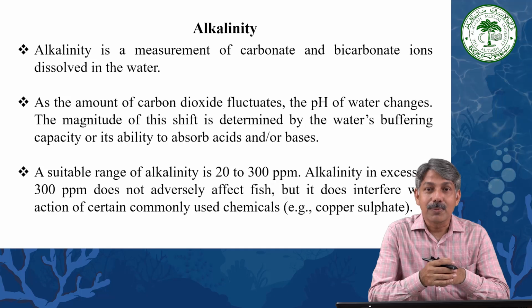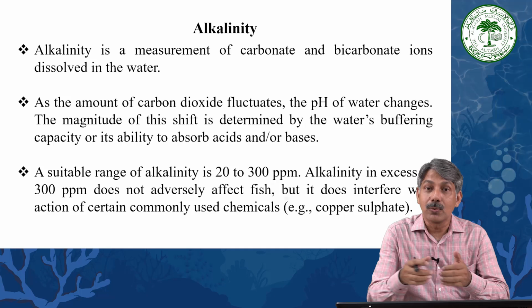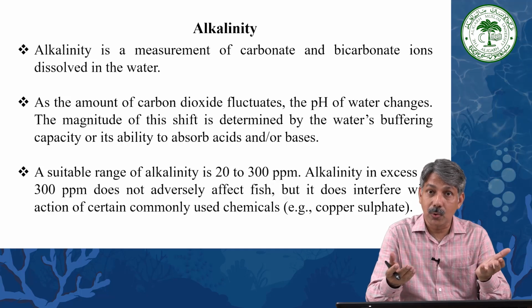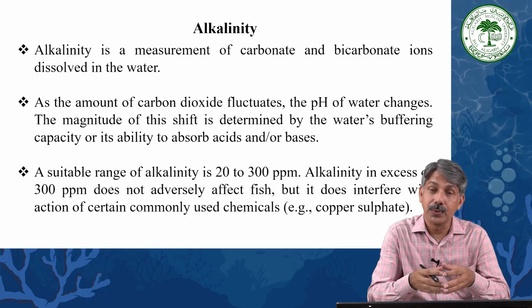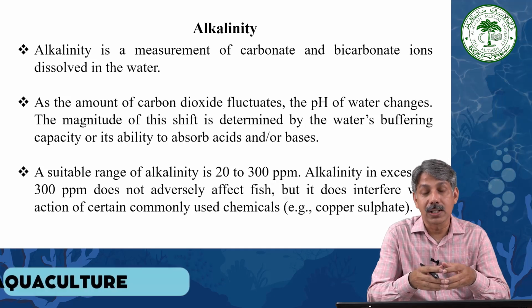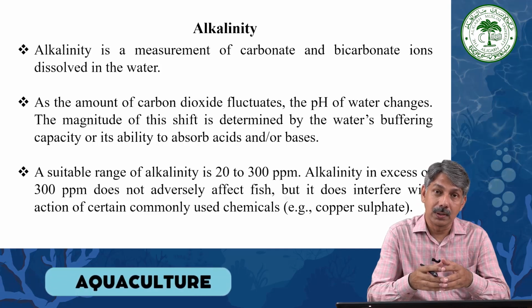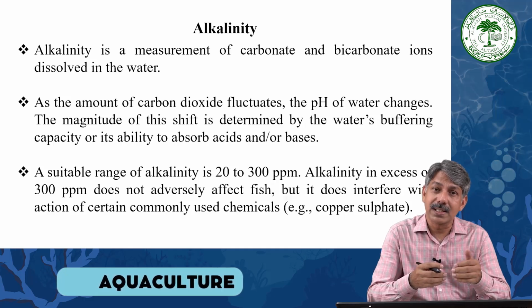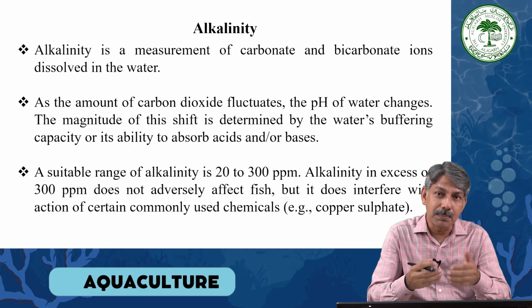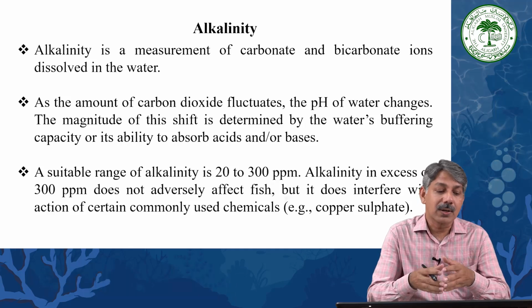In the previous lecture, if you remember, we discussed the water quality in general, and the importance of water quality in aquaculture, whether you are going for freshwater aquaculture, brackish-water aquaculture, or mariculture. I showed you the range of different water quality parameters required for aquaculture. Then we also discussed in a little bit of detail temperature, dissolved oxygen and pH. Now, today we are going to start with the parameter alkalinity.